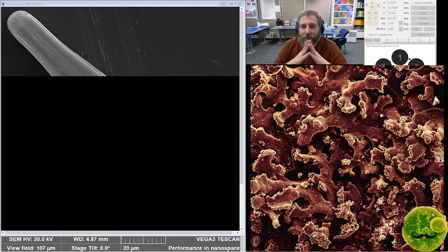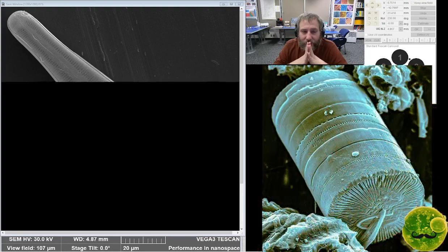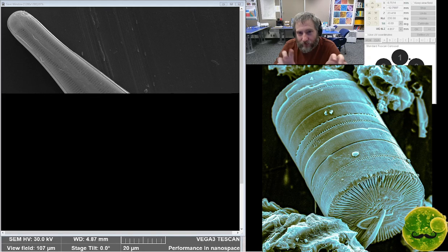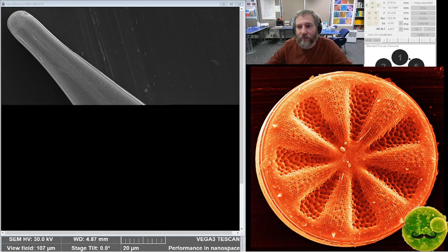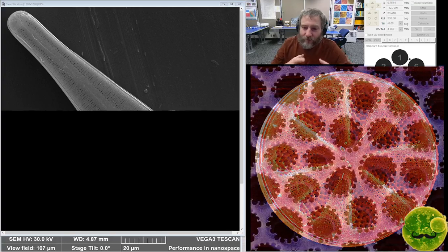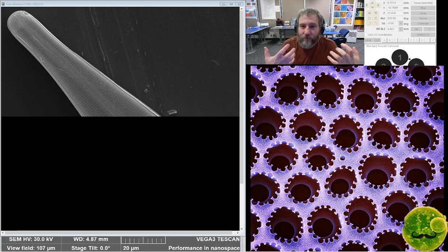I'm looking at diatoms. They're a type of microscopic algae, and you can't see them with the naked eye. They make a skeleton called a frustule. The frustule has two parts called valves, each one independent. Usually they're together, but when they die, sometimes they disarticulate into two different valves. So we can see the inside of the diatom when they disarticulate, or the outside of the diatom.